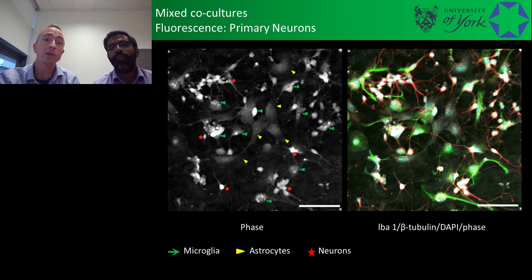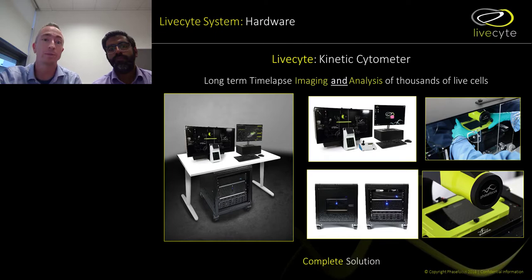And then at the end of our time lapse, our label-free image, we could stop the experiment and do our endpoint assay, adding the fluorescence molecules to it. So we can do that as an endpoint. But that's not always what you want to do. Sometimes you need fluorescence at the same time, and we'll look at that later.